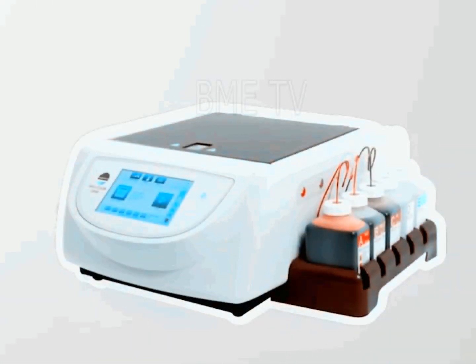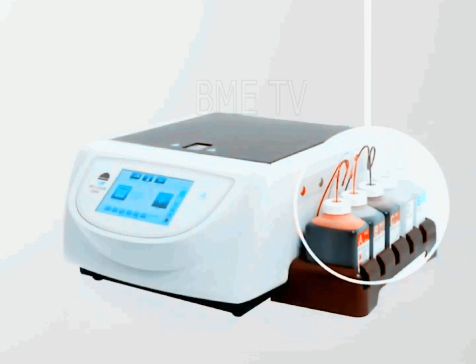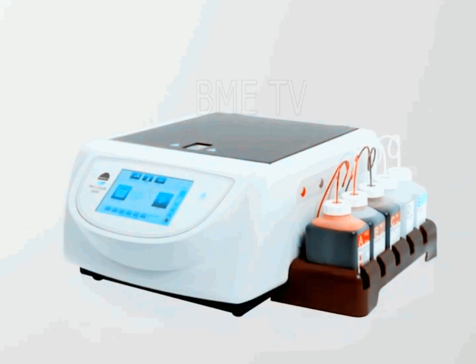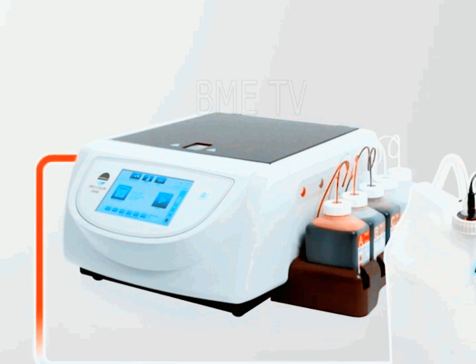Diaminobenzidine is the most common chromogen used in IHC assays. Unfortunately, diaminobenzidine is hazardous and has a special, more expensive handling requirement as a waste product. If kept separate from non-hazardous waste, the expense of handling or neutralizing the diaminobenzidine is reduced. If, however, the diaminobenzidine is combined with non-hazardous waste, all the waste must be processed as hazardous waste.